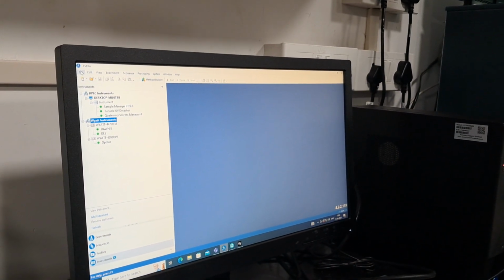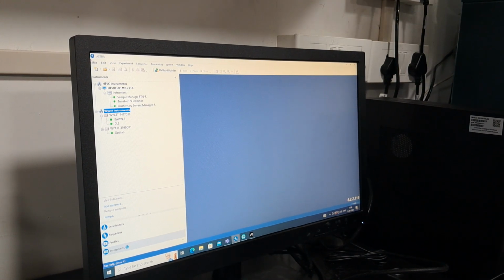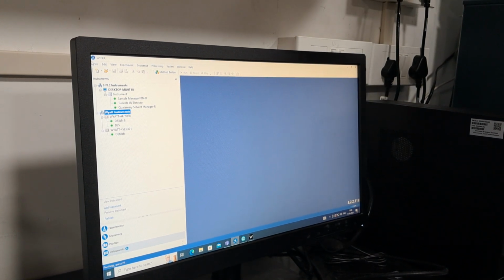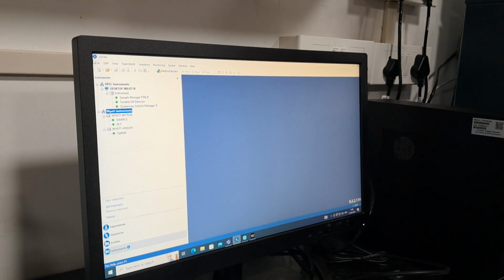So first is the mobile phase you have used. The mobile phase filter should be properly dipped inside. It is called the mobile phase filter. It is from the A channel. I have kept it here, A channel. Okay, fine.